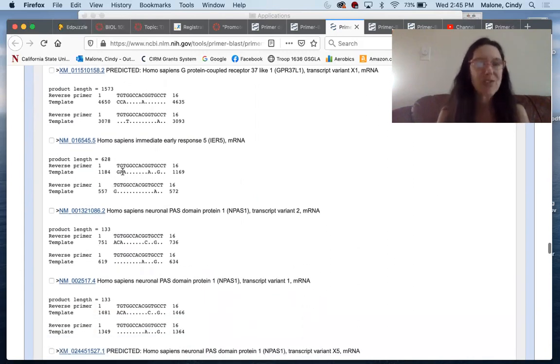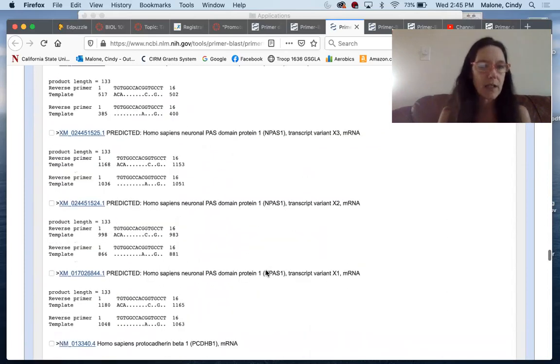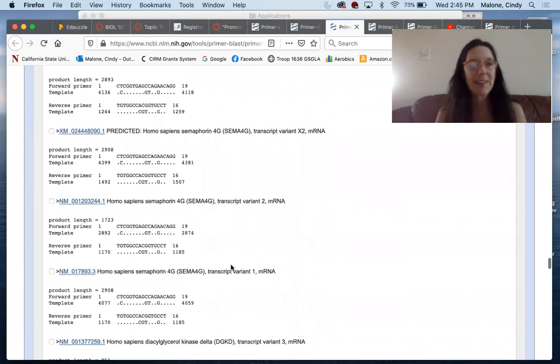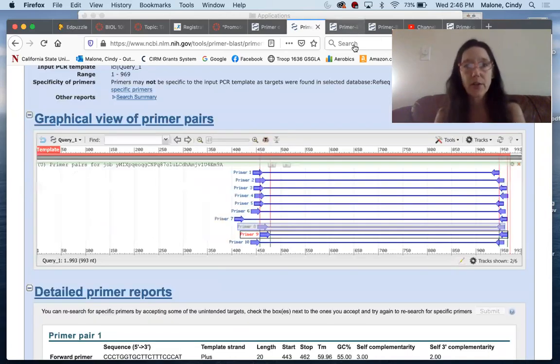It's only 2 mismatches, but there's a bunch of mismatches. It should not sit. But in science, what you don't want happening always happens. This is tiny, tiny. That won't interfere. Tiny, tiny, tiny. Big, big, big. But there seems to be a lot more of them for this guy than for our other primer pair. So I would say our other guy's better.